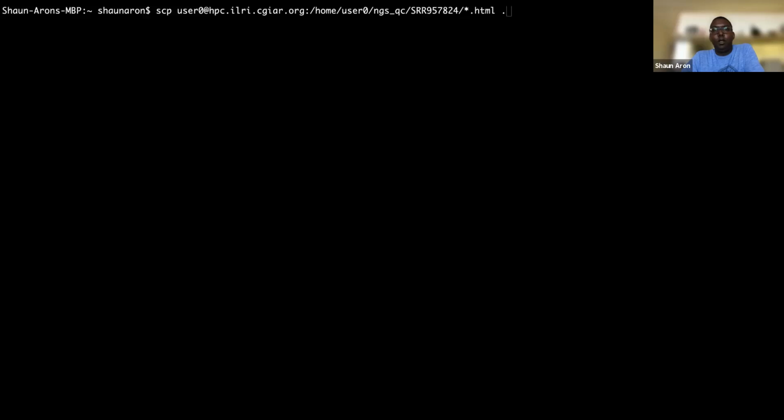Okay, anyone else stuck? Anyone else need some guidance? I guess getting through this practical is heavily dependent on how well you've managed to pick up the command line skills. If you are struggling, you probably just need to have a bit more practice with command line. But nobody's really getting stuck, so I'm assuming everyone is doing okay. So please let me know if you are stuck.